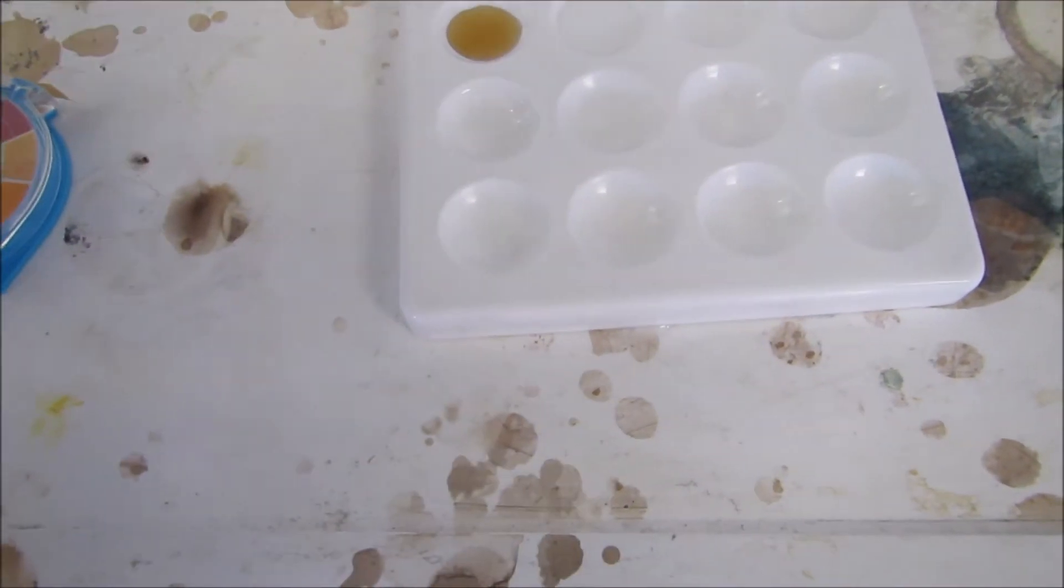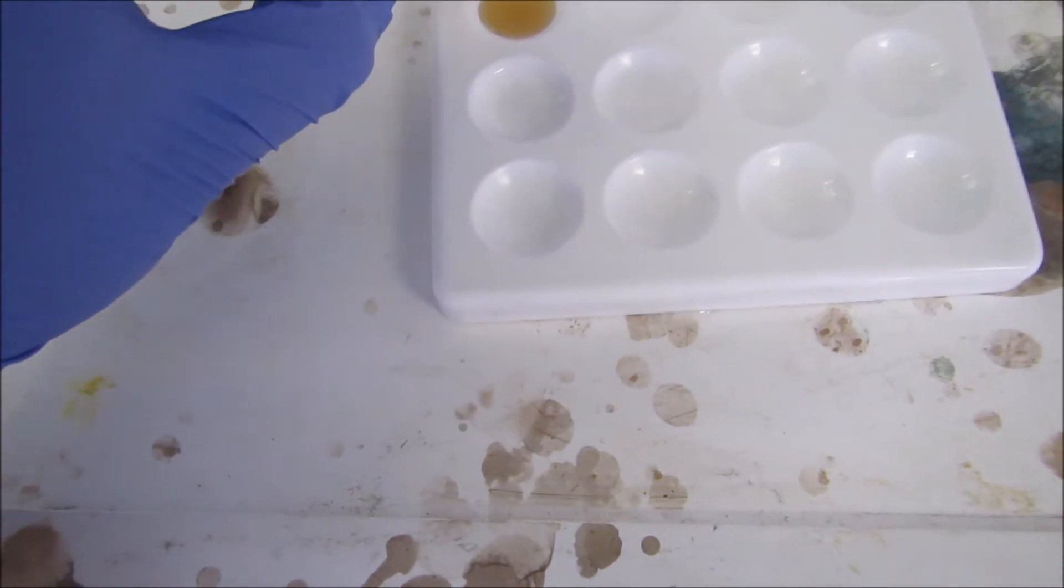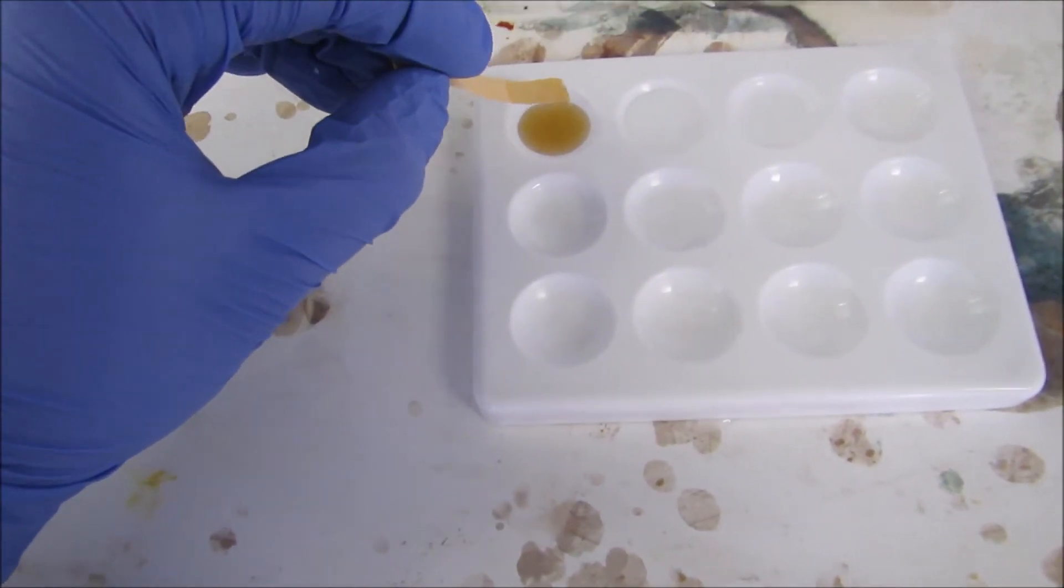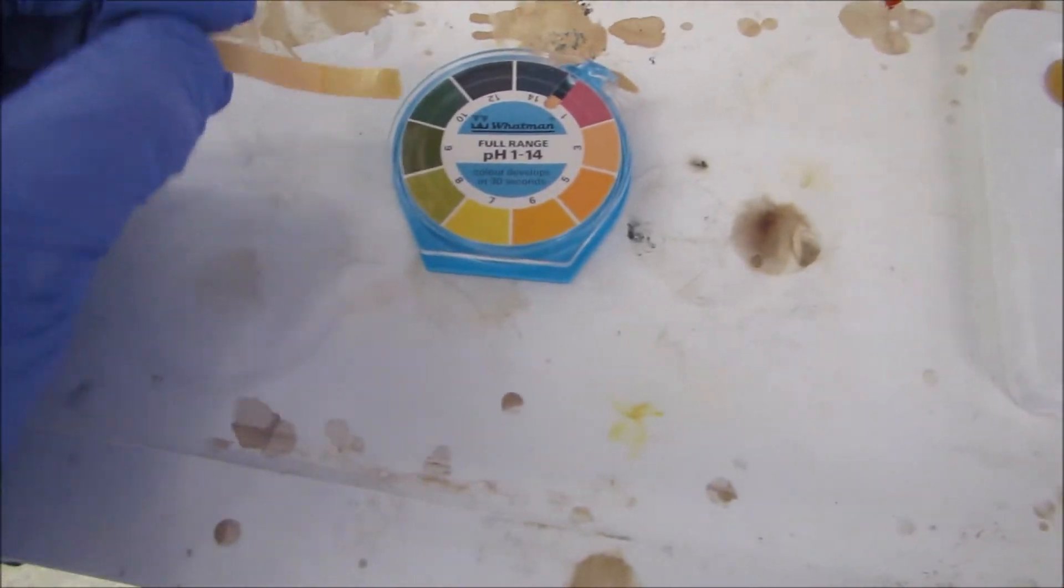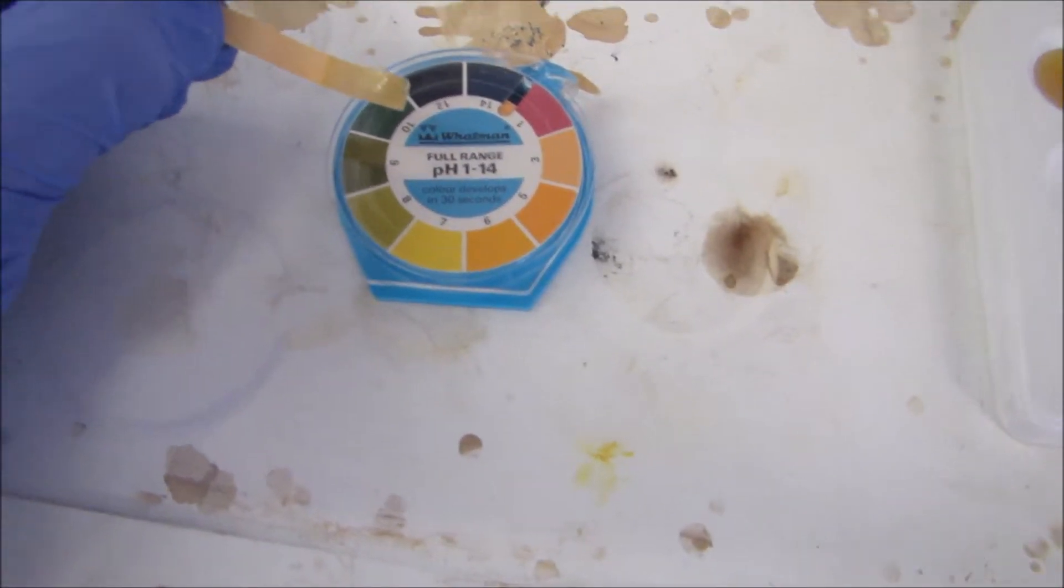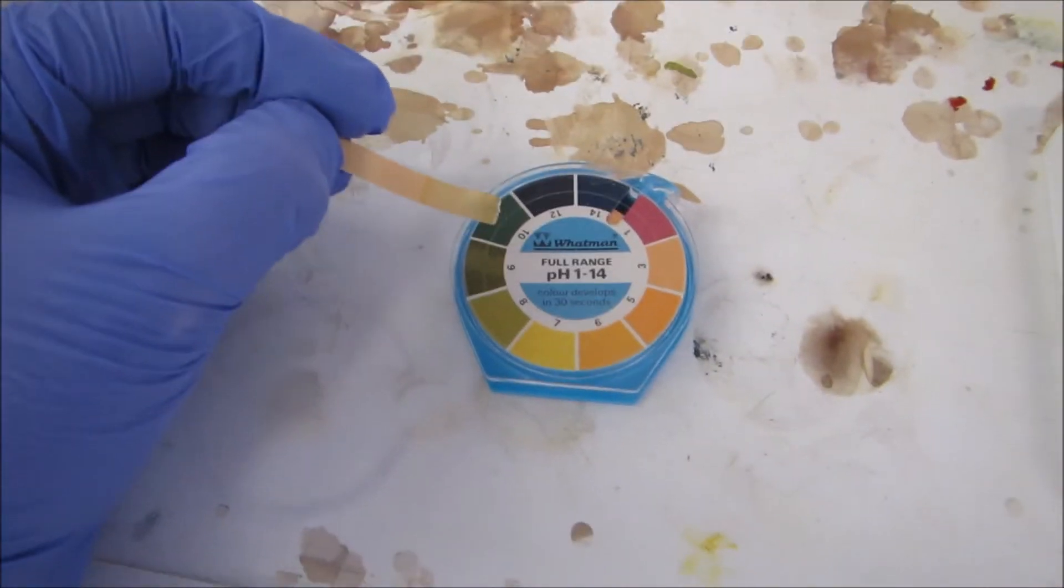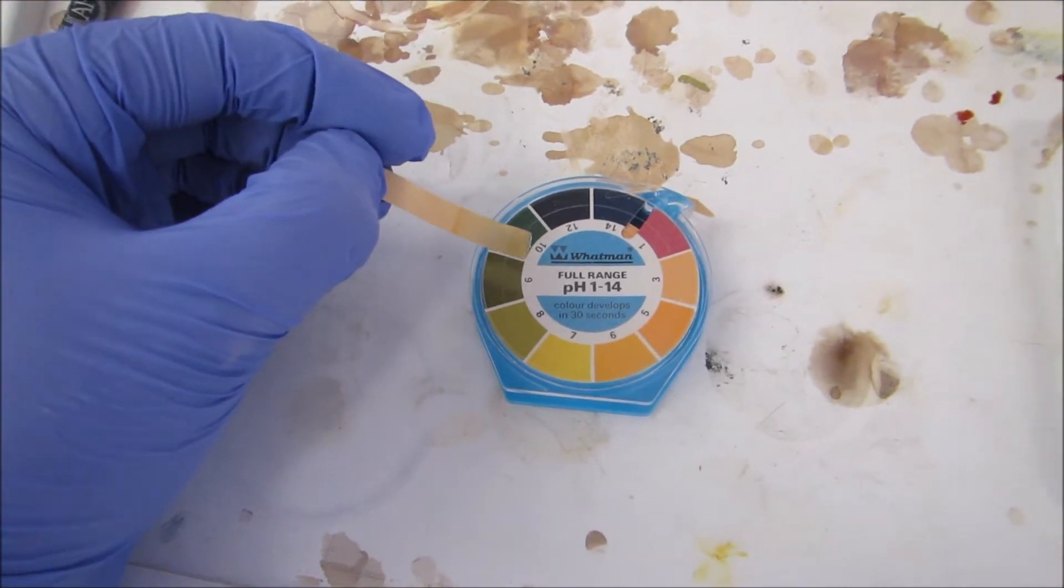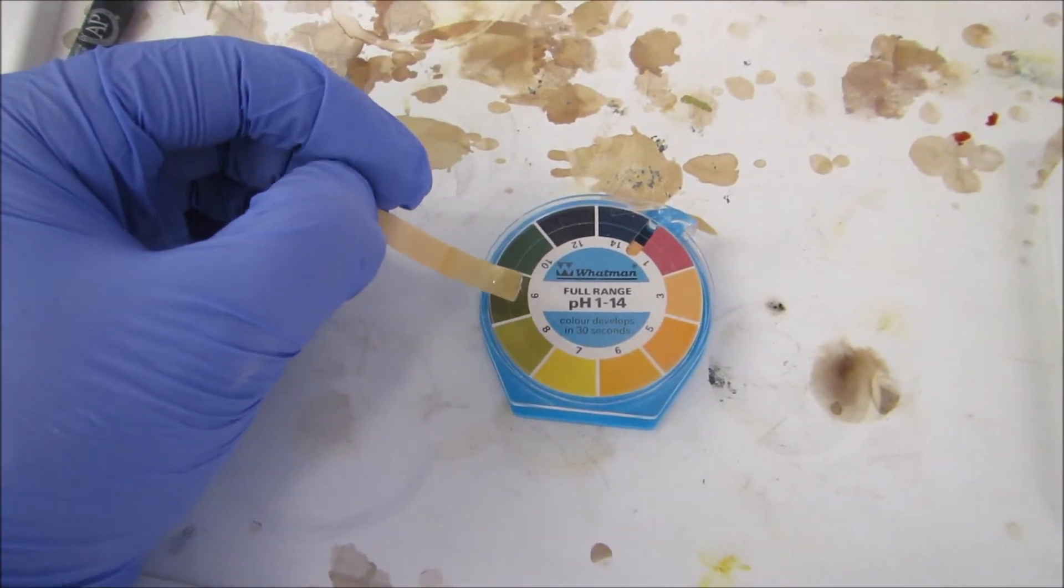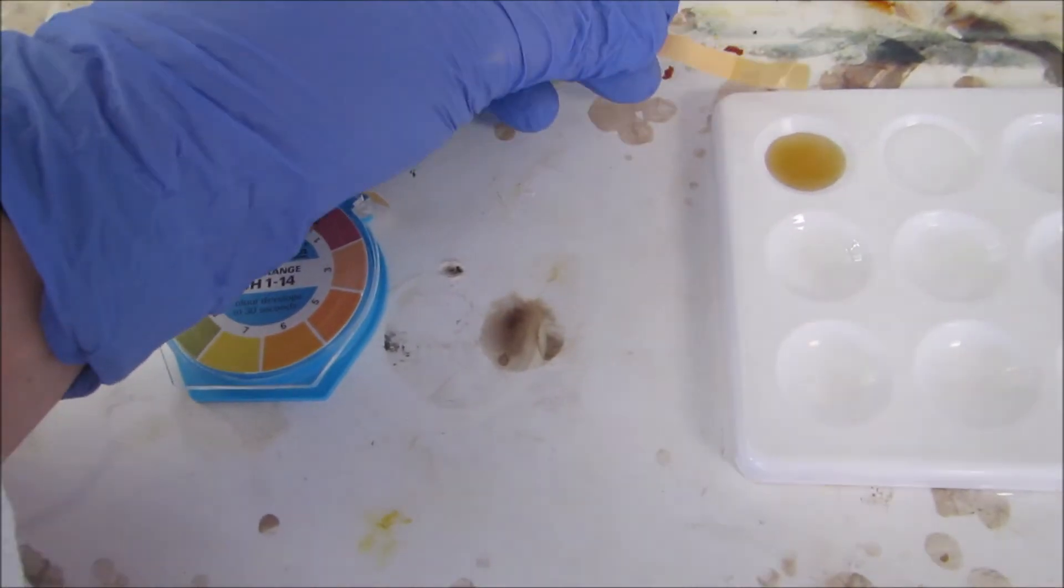First one is the amine. I'm going to put in the pH paper and it's coming up around probably between pH 9 and pH 10, the slight green. This means that it's alkaline.